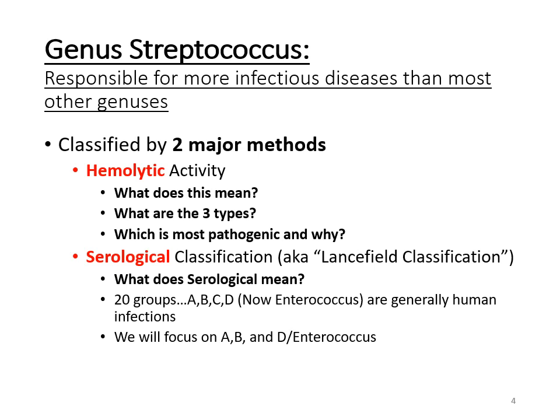So hemolytic we encountered last time. When you hear hemolytic or hemolysis, this means that the bacteria is capable of breaking down your red blood cells. Remember we said that there are three types of hemolytic activity that you have to know. There's alpha, beta, and gamma. But we usually organize them in the order of beta, alpha, and gamma, going from the most pathogenic to the least pathogenic. So remember the trick we said, beta, you can remember that's the worst by saying beta bad.